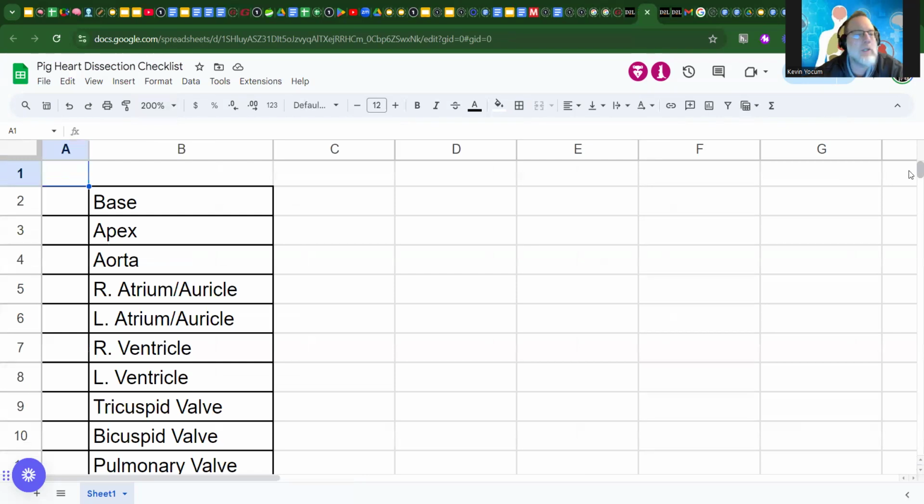All right, so when we look at the heart, our hearts are going to be covered, and our cow hearts as well. These might be pig hearts. Andrew gets both, so I have pig heart. They could be cow heart. They're not much different in size. They're actually very similar in size to our hearts. They might even be slightly larger, especially if it's the cow hearts. But anyway, cow hearts, pig hearts, human hearts are fairly similar in size and appearance.